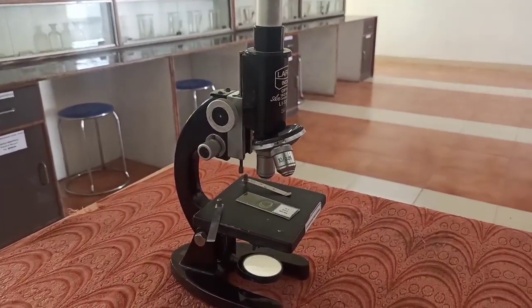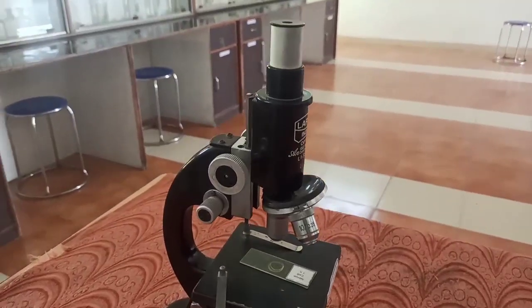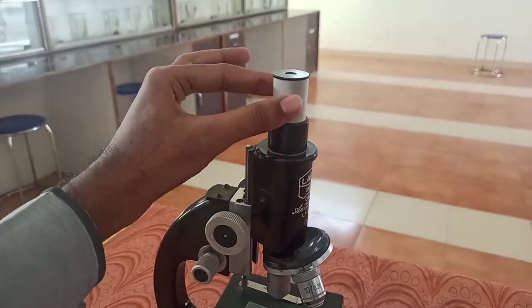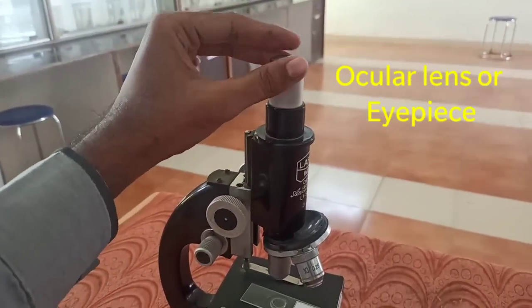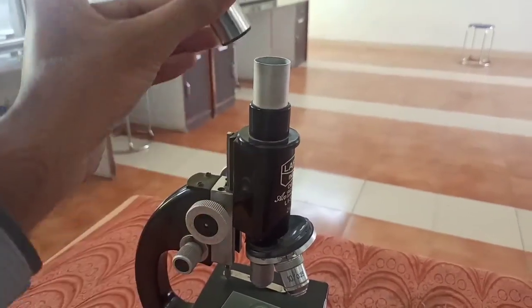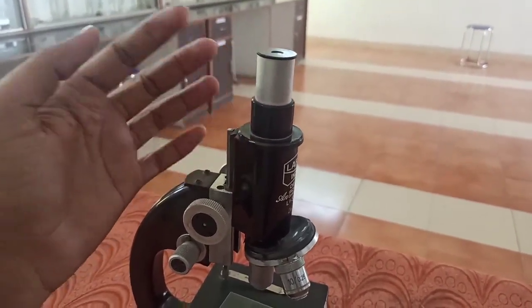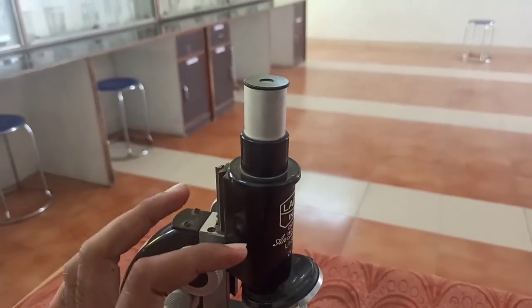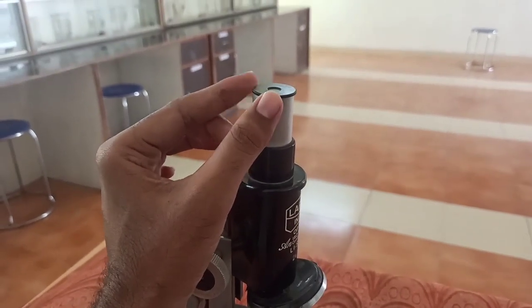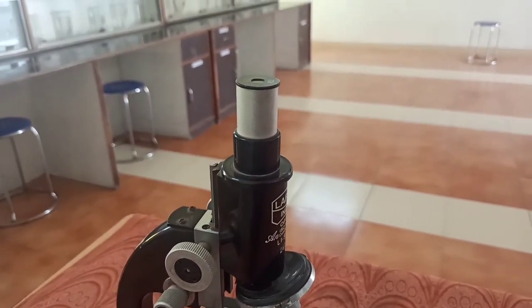Now students, we are going to discuss each part of the microscope and its respective function. First of all, let us start from the apex. This is called the ocular lens or eyepiece. It is the lens which is closest to the eye and it gives the image to our eyes. Image formation is actually done in the body tube, and the image will be visible to you through this lens. So this is the ocular lens, also called the eyepiece.